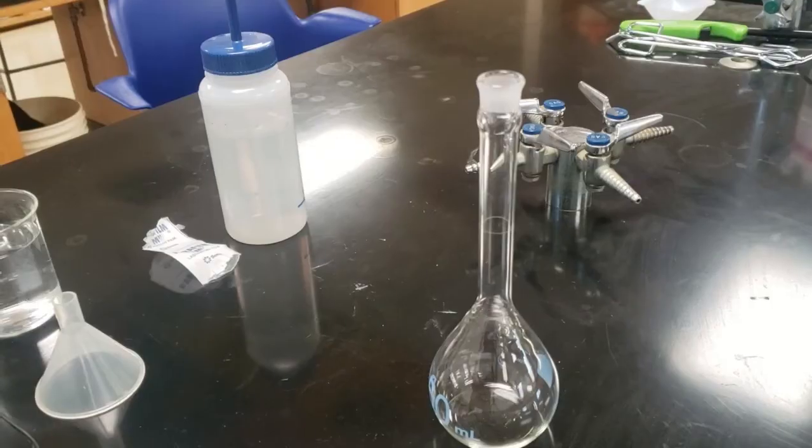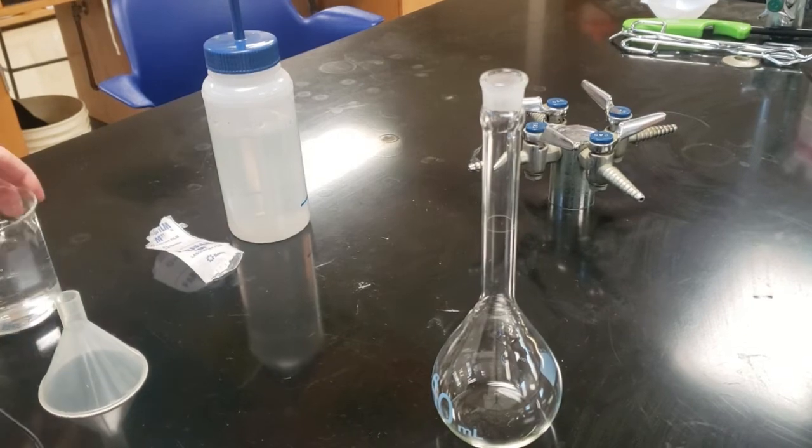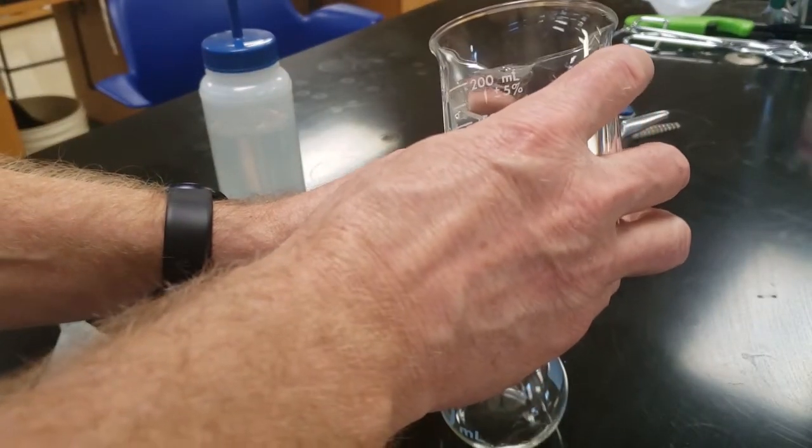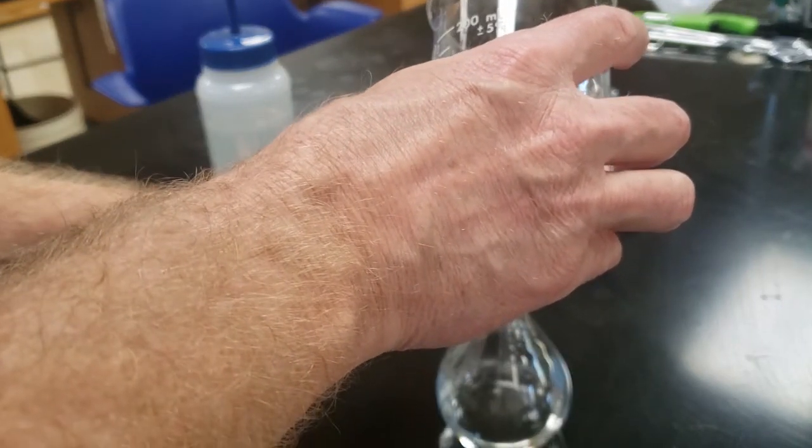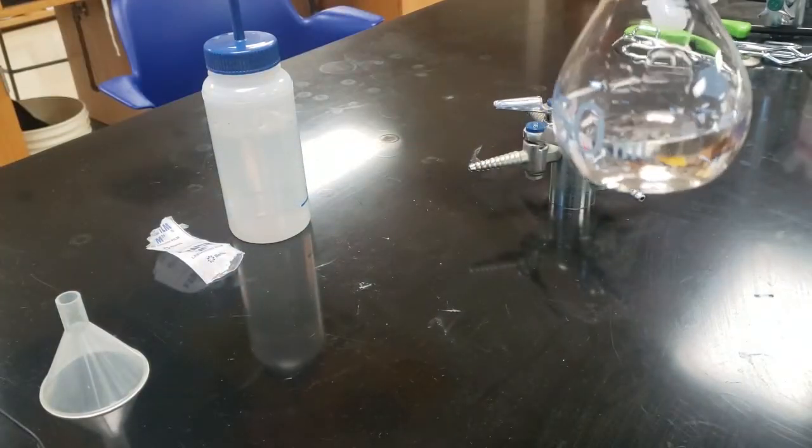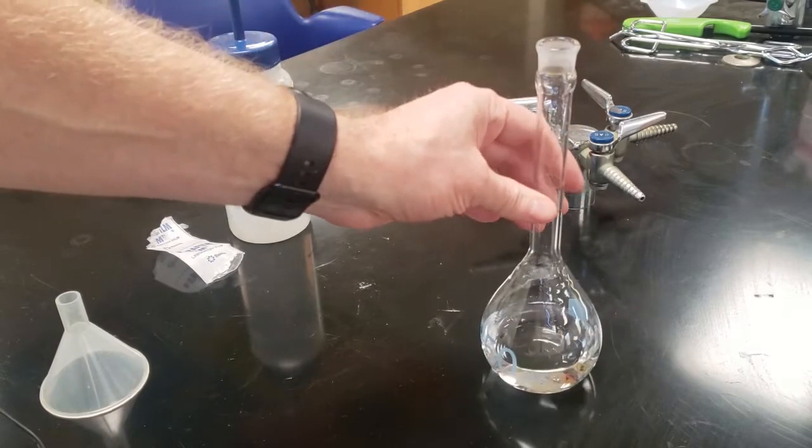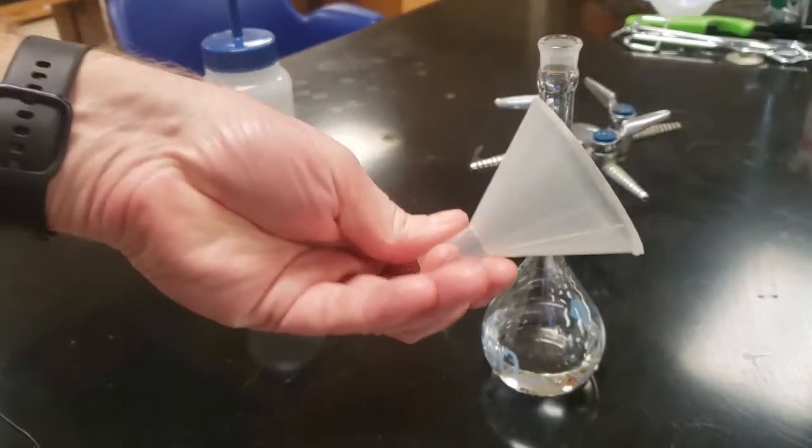We're going to get the 250 milliliter volumetric flask. We're going to pour some distilled water in there. We want to fill about halfway up. It's not a measured halfway. We just want to put some liquid in there so that when we put the ionic solid in, it will be able to dissolve into water. Also, we don't want it too full because we want to shake it up and swirl it around. If it's too full, it's not going to be able to have this agitation.